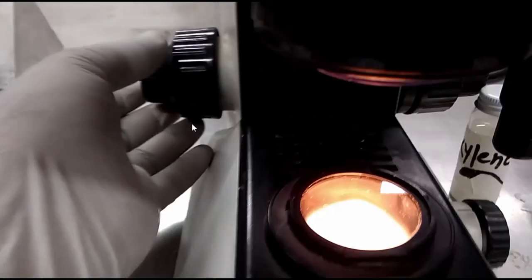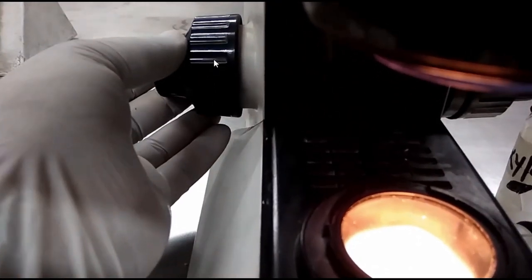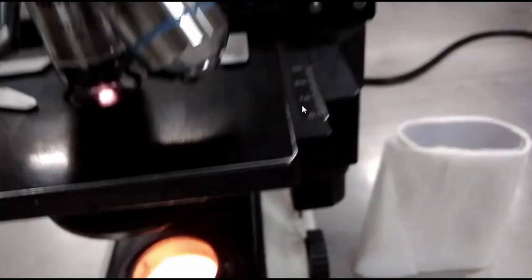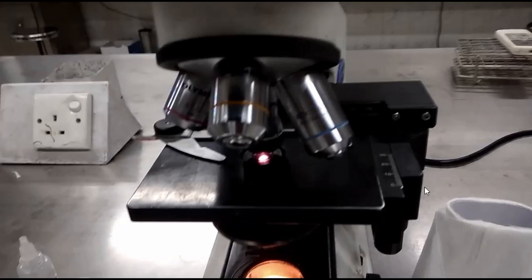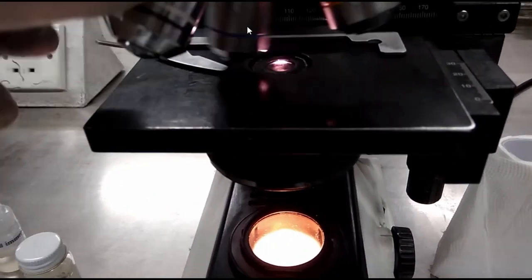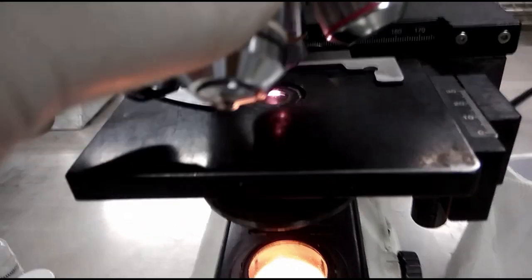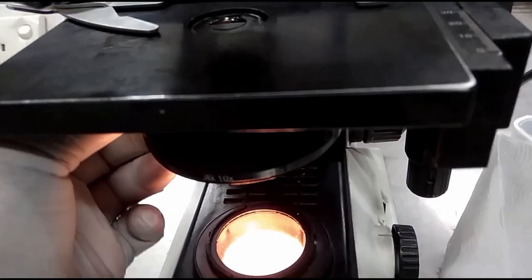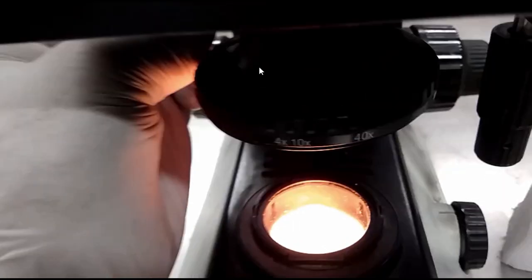This is the fine adjustment and this one is the coarse adjustment. This is the mechanical stage, which can be moved by this. This one is the revolving nosepiece. With the help of this, the lens can be adjusted. This one is the mechanical stage and this one is the clip.